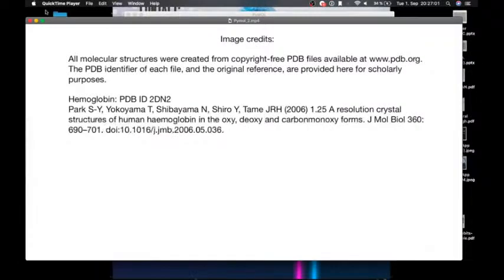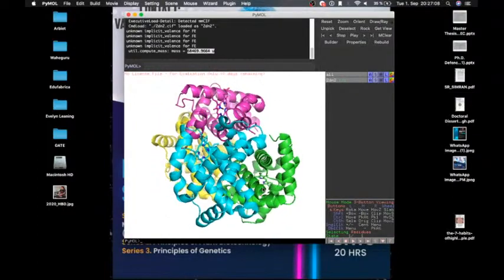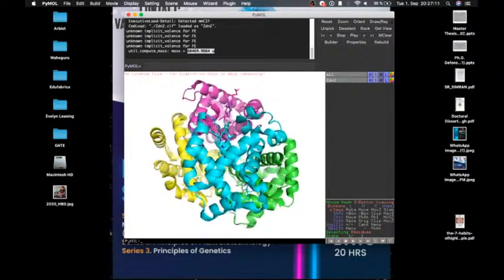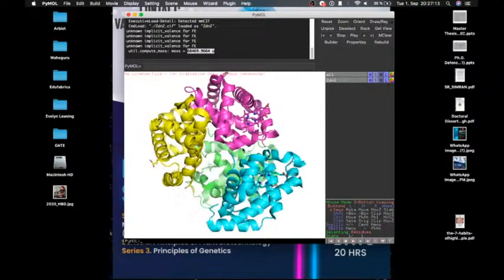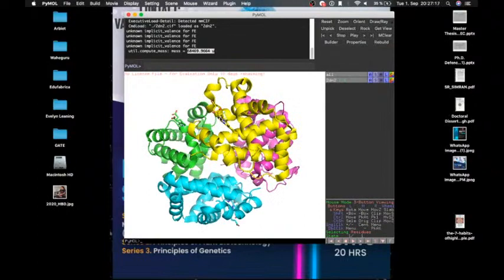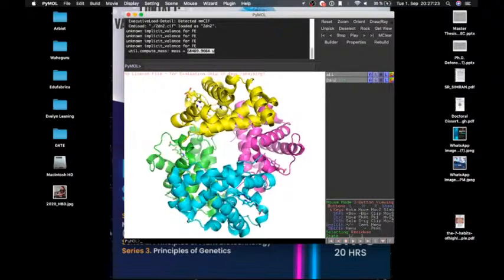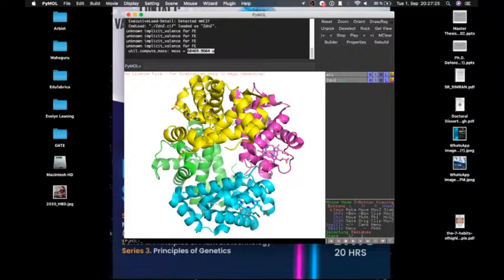And a little bit of practical experience about using PyMOL, where you can check inside the four polypeptide structure. There's a heme in the stick form in all four of those structures in the center. And you can find the molecular weight, you can check the alpha helix structures, there are so many.